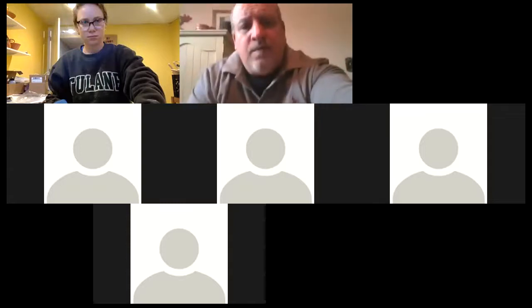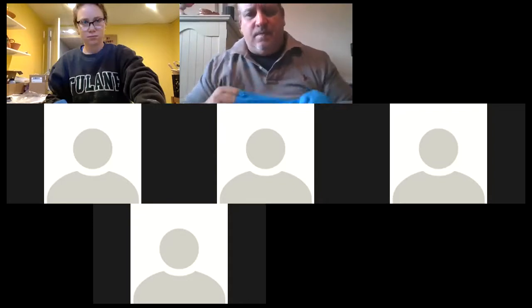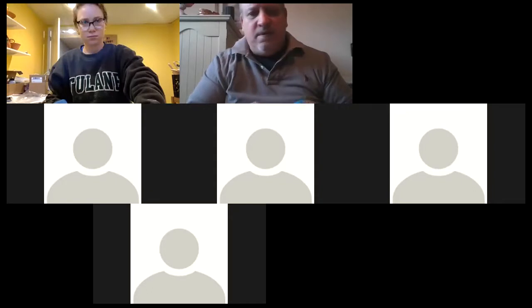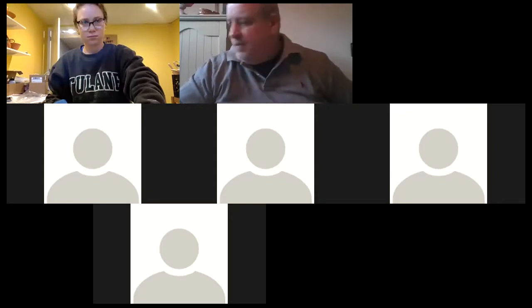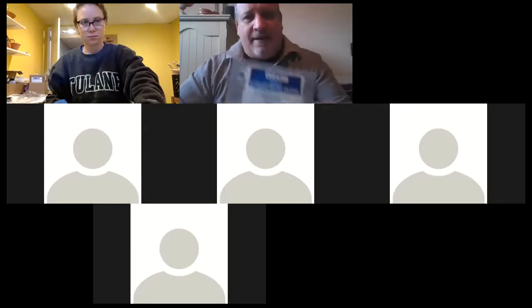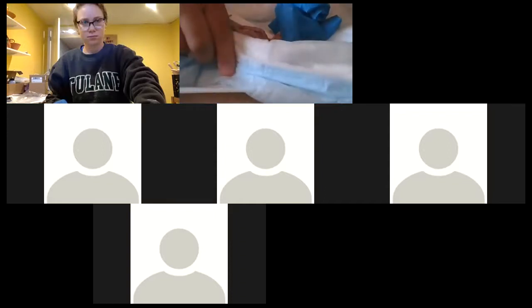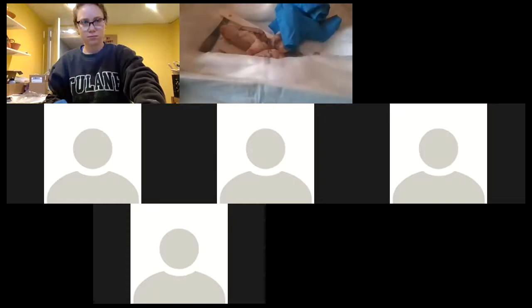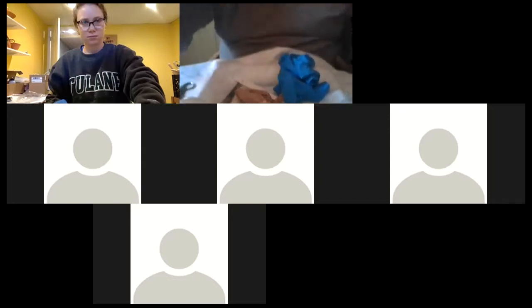How did it work out? Anybody do it with me? So you guys at home, if you want me to do it with you, let me know. If you're watching the recording, just be careful. You should be wearing older clothes like this, just in case. I think the smell is one of the worst things. But it's not so bad. Keep a window open. Wear a mask if the smell is bothering you, and be careful of the splashing. Although the brain of the sheep is not so wet. Just when you take it out of the packaging, be really careful. Like I did, as you can see, I put this sponge pad over the right section. And then I can just throw everything out. Because you get a whole separate set for your cow eye. Sorry, I said sheep eye on the email, but it's a cow eye.